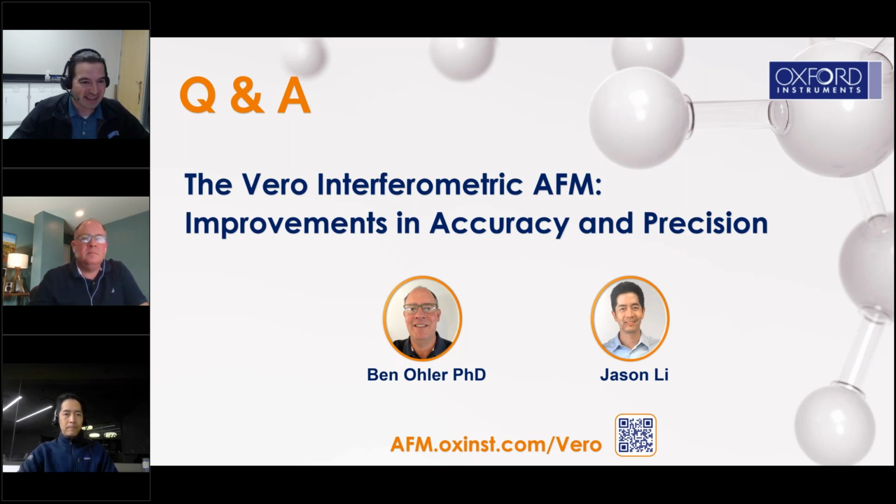Great, thank you. So here's a question addressed to Ben. Can you do standard AFM modes with Vero, such as tapping mode, MFM, KPFM?